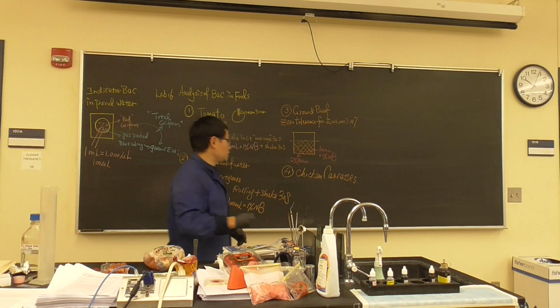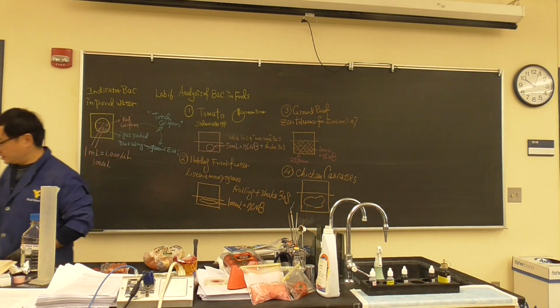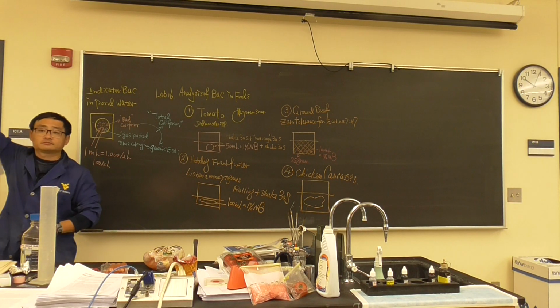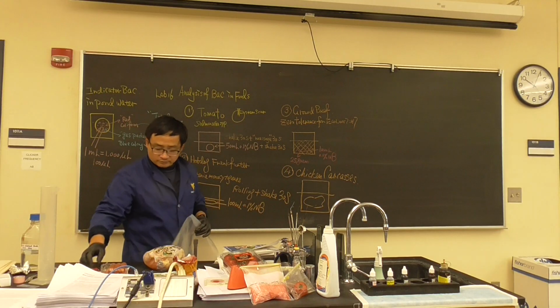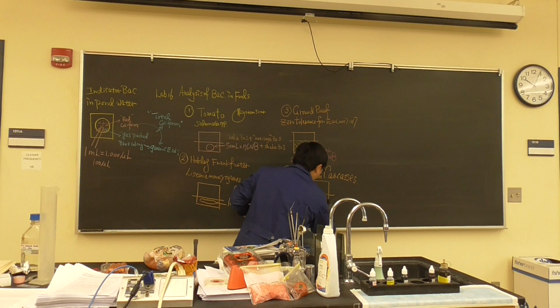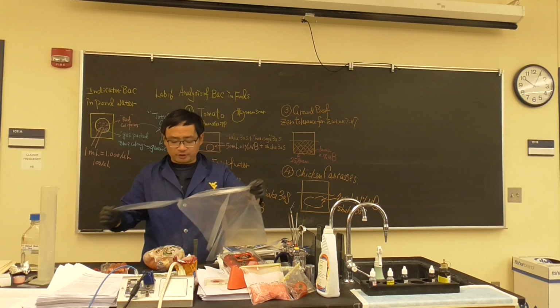Here we're going to talk about how we do the sampling. Poultry is large, so we use a poultry sampling bag. We put the birds there. The bag is huge like this. We're going to dump 200 ml of 0.1% nutrient broth, and then we vigorously shake for 30 seconds. So how we do it, you may need 2 people to work together.